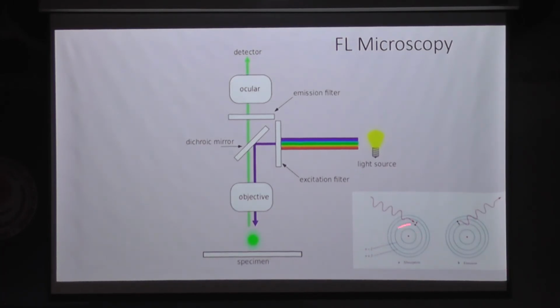So this is how they jump into the orbits. Light is incident, they are getting energized, and then they are coming back. They are getting excited here, and the second thing is they are getting emitted. When the light falls onto the fluorophores, they get excited, and when they get excited, some light is also given out as an output of their excitation. So light falls onto the fluorophore, and some light comes out of the fluorophore as energy.